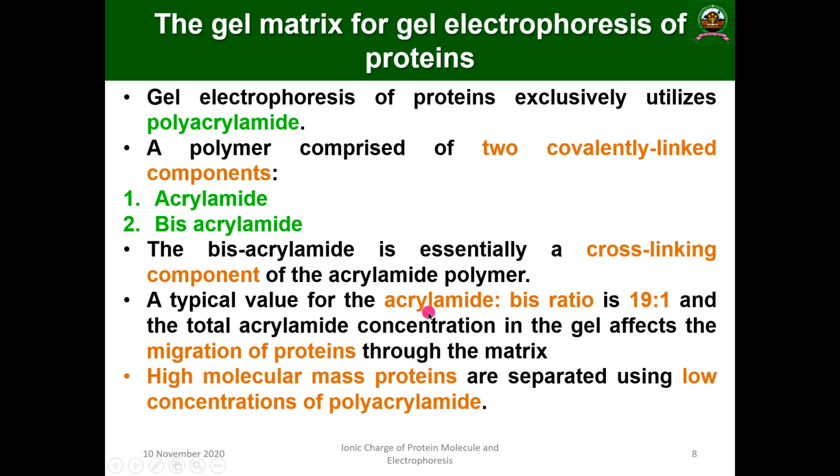Okay, so the concentration of the acrylamide gel is very, very important. It is inversely related to the migration of the protein.